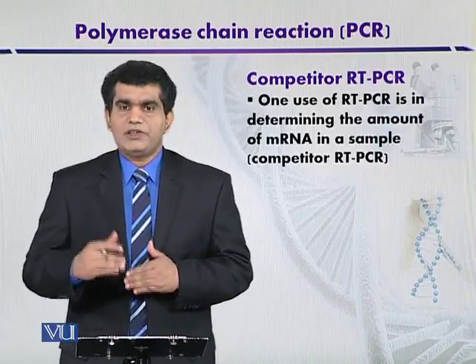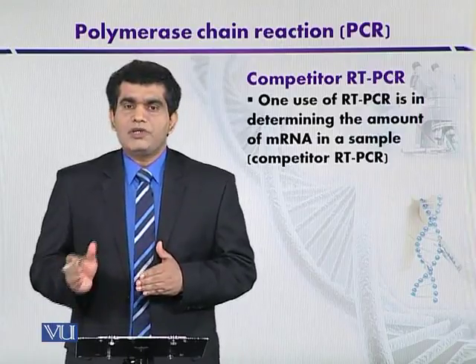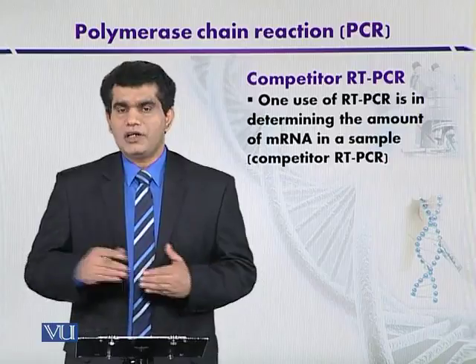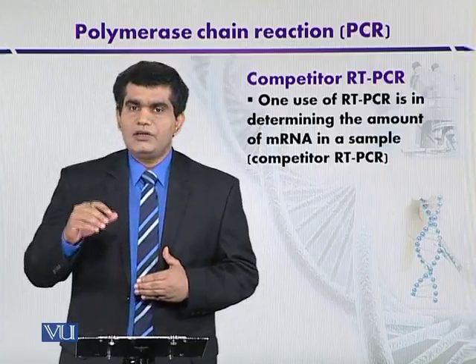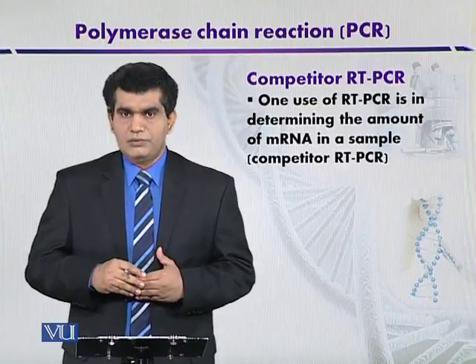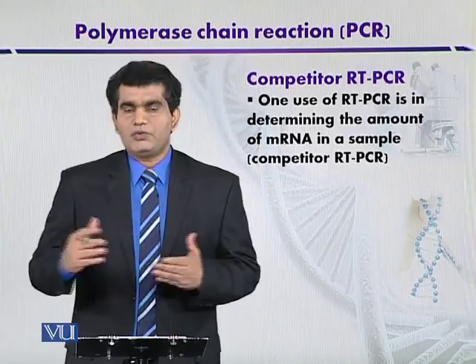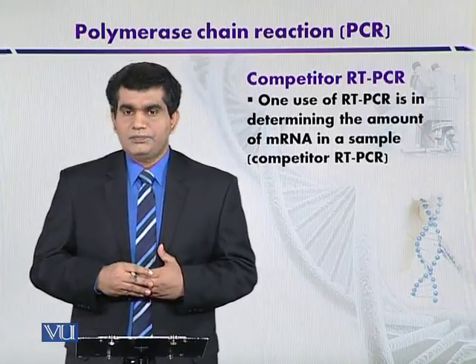That is, they may be present naturally in the tissue, or they may be the result of contamination from the laboratory environment. In either case, they can inhibit or degrade the RNA molecule. So, if RNA is there and because of such inhibitors we can't see it, we don't have any quantification.